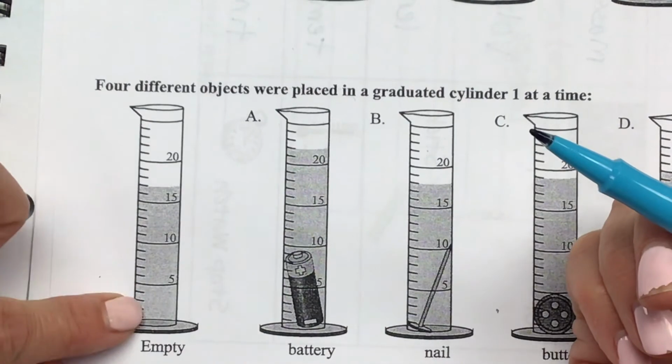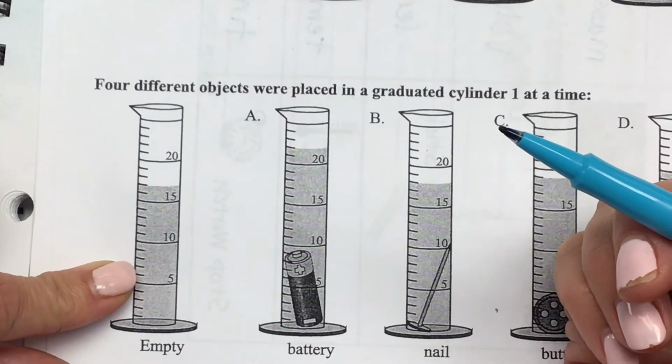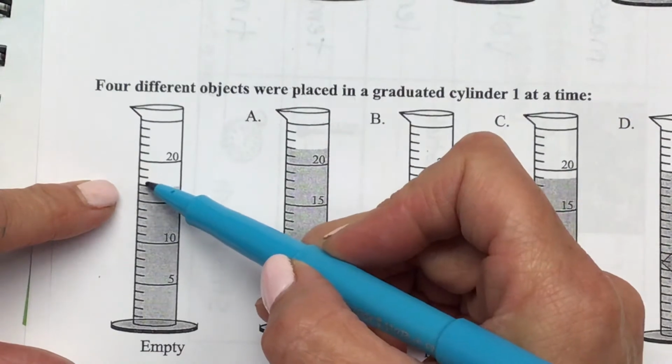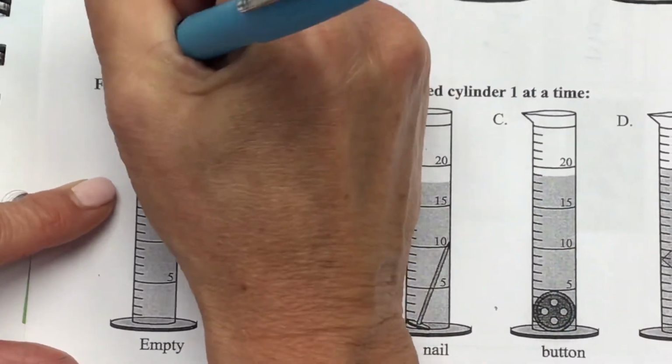Be careful. Look at the scale. How many milliliters? Harper? 17, 15, 16. This is 17 milliliters.